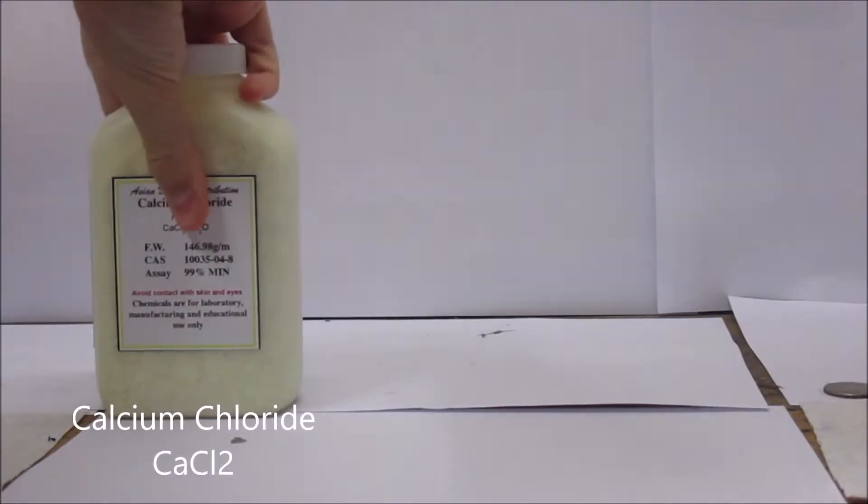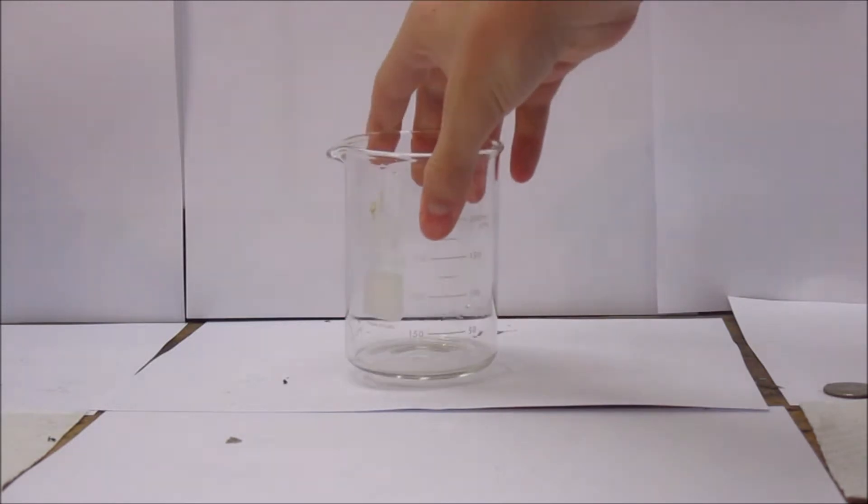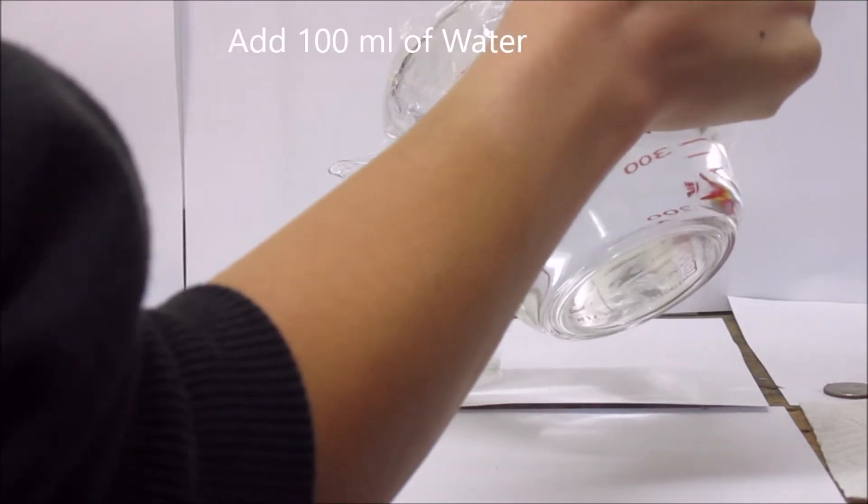To make the calcium carbonate, we will need calcium chloride and baking soda. To start, I got a beaker, then filled it up with 100 ml of water.